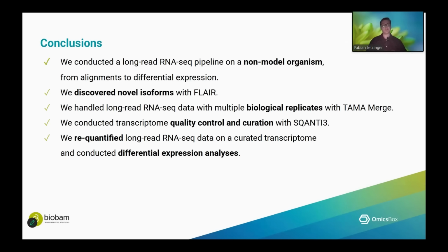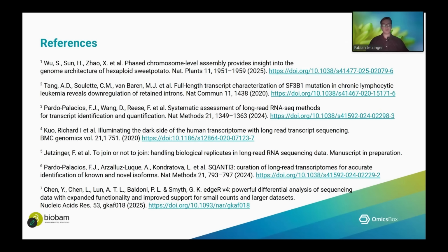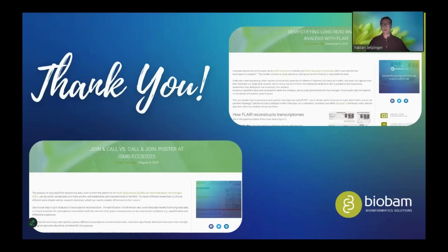With just a few clicks, we go from raw data to results, and we can play around with parameters and inspect our results in a lot of detail. So these are the references used for all of these different steps in our analysis. And with that, I would like to thank you for attending and for your attention.